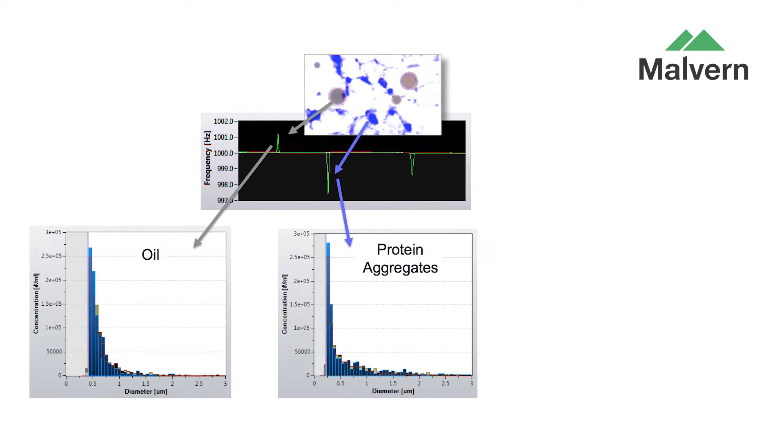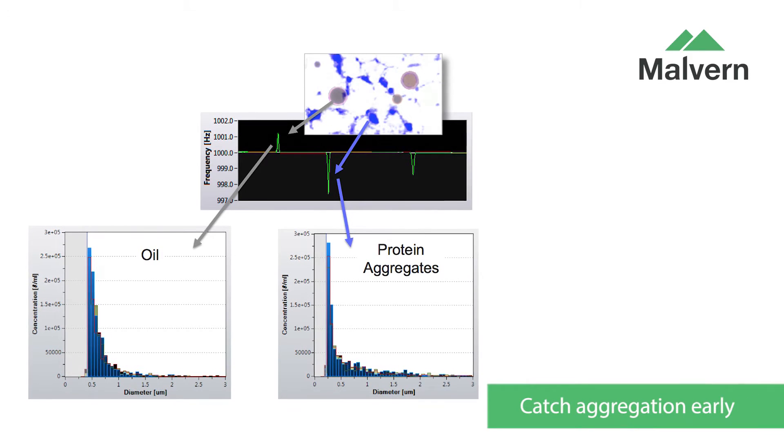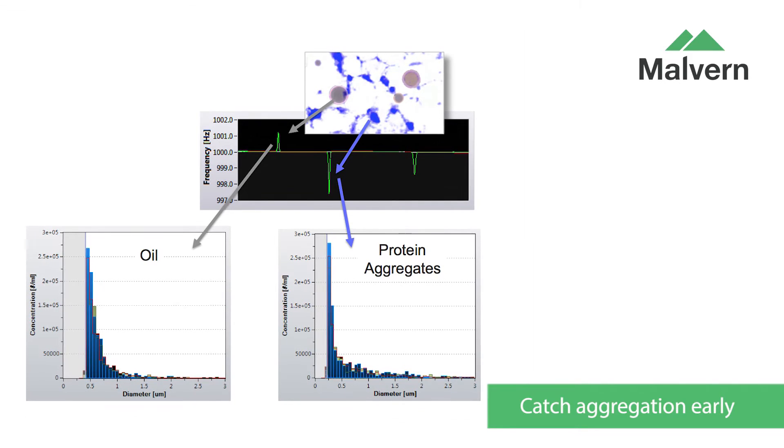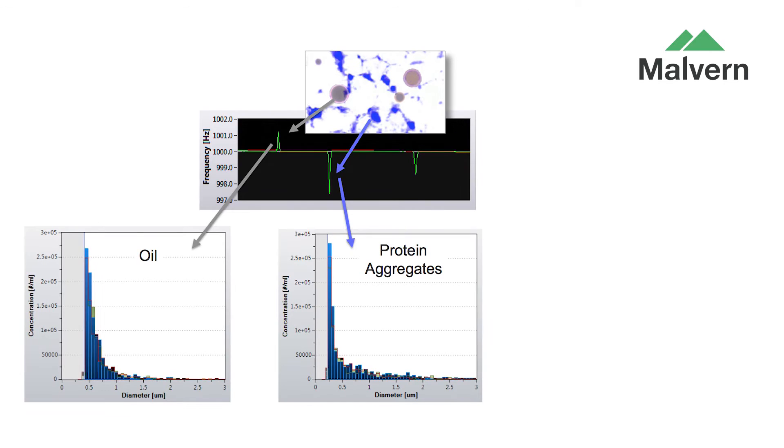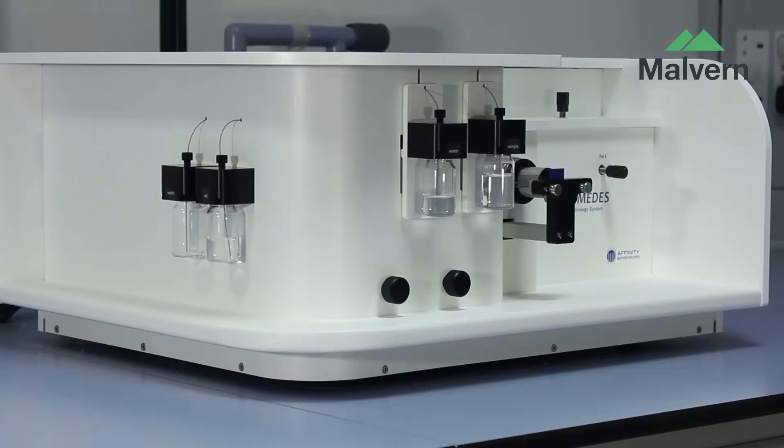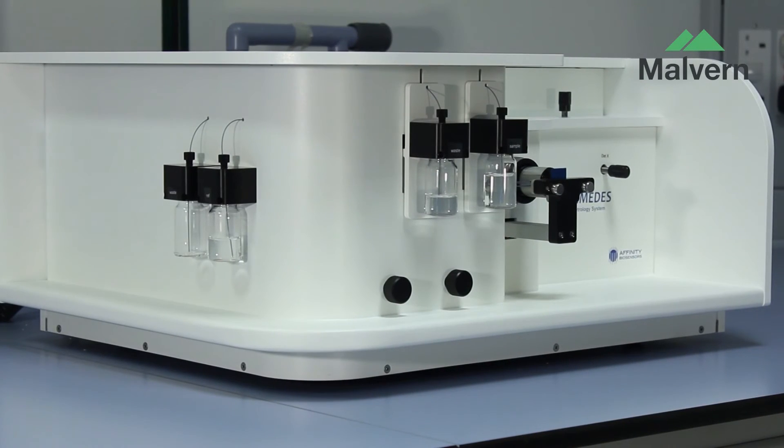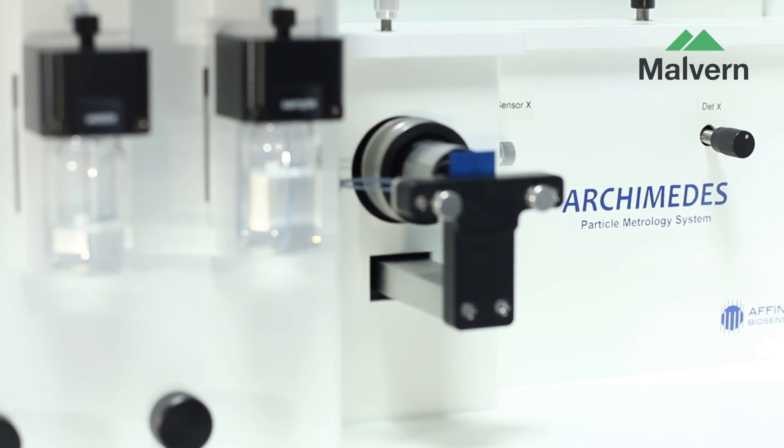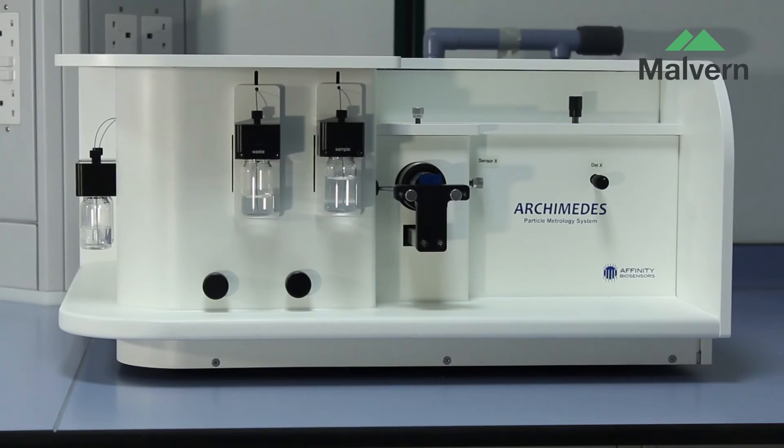If you're interested in detecting and counting aggregates smaller than one or two microns in protein formulations, Archimedes is perfect for your application. There's growing R&D and regulatory interest in quantifying particles in this size range, not least because they're increasingly linked with possible immunogenic effects.